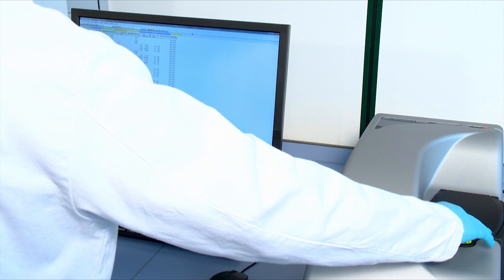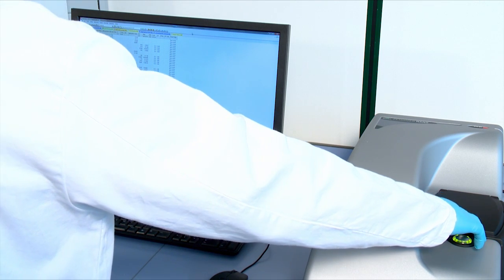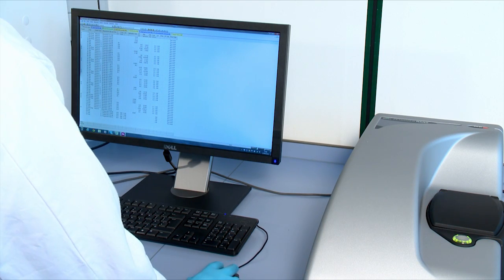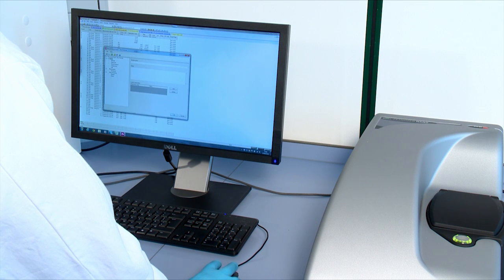Once the sample has been introduced, the instrument is controlled by the Zetacizer software. The measurement is very simple as the Protein Mobility Standard Operating Procedure or SOP presets all measurement conditions.